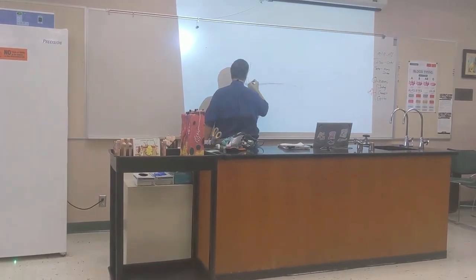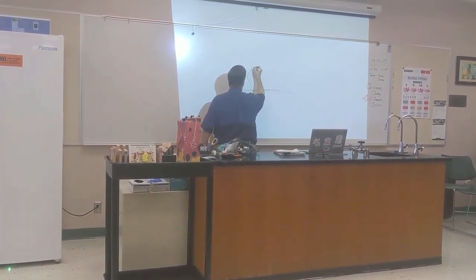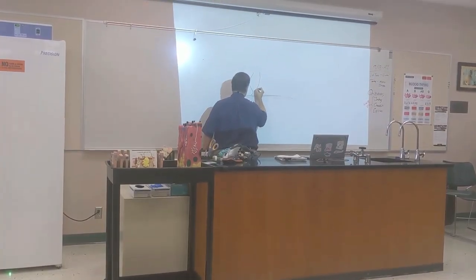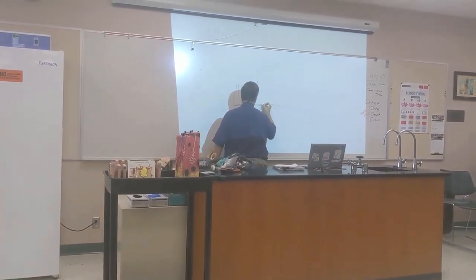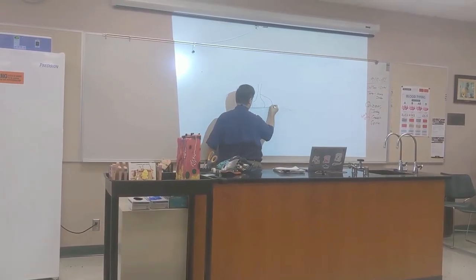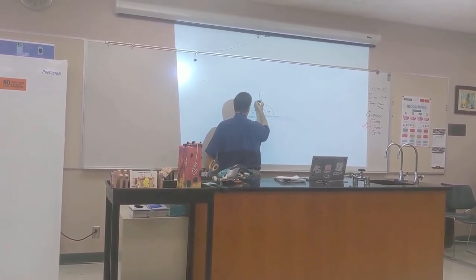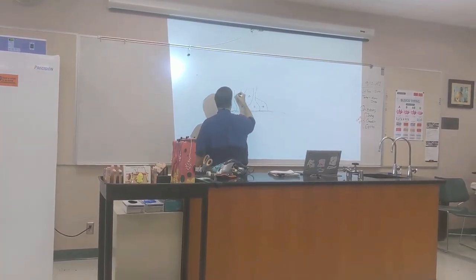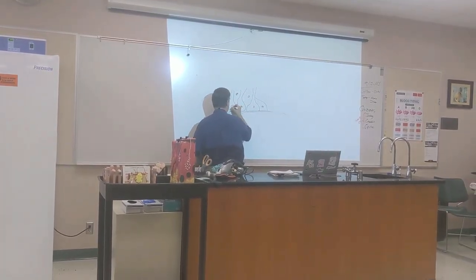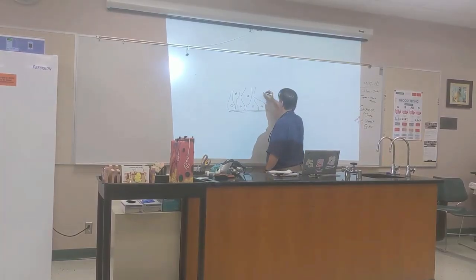Imagine you have a mixture of cells. Think of them as wine goblets and upside down wine goblets for the basic shape, like that. Then you got a couple weird things that don't even go to the top, not even up to the apex. We've got this going on. Anytime you have a cell with a big, fat, thick area, that's probably where the nucleus is going to hang. All right.